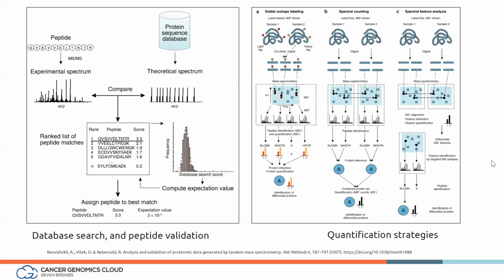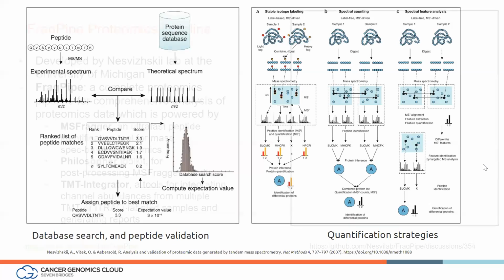So basically, that's a basic workflow that most pipelines follow. It's pretty standard, and we have a tool or a set of tools that can easily give people access to all these options in a very easy way. So next, please.